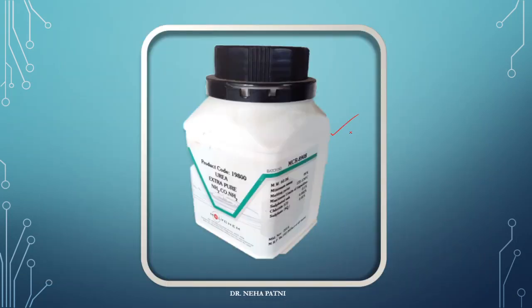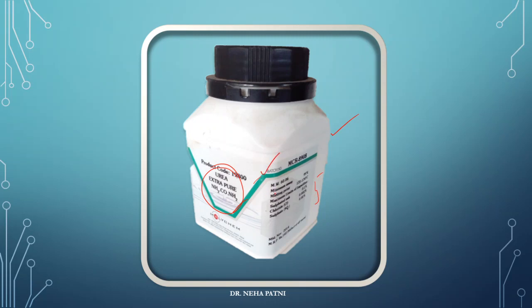This is a reagent bottle — a sample bottle — wherein you can see the name, formula, product code, molecular weight, minimum melting point, and different constituents. Before taking any substance for testing, you must cross-check and read these things. These are nothing but spatulas — you cannot call them spoons, though they work similarly. They are used to transfer a particular substance from one place to another and come in different sizes.